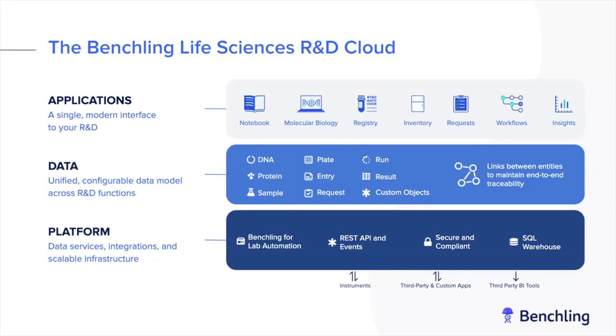Benchling is built on a modern cloud infrastructure, fully managed by us and able to offer state-of-the-art security and control. And we know that for a lot of companies with a rich ecosystem of instruments, software applications, and additional data stores that their R&D teams depend on, we provide a full set of REST APIs that can help you connect in and out of all of these additional applications and instruments.